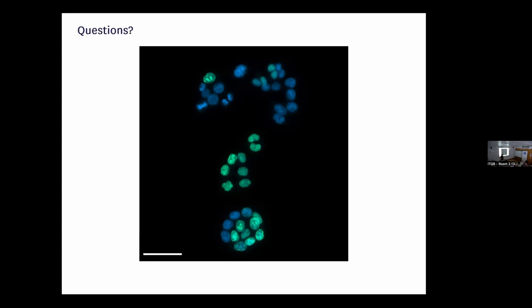Typically, when you're talking about damaging, those are usually much higher laser intensities than the ones required for photobleaching. I mean, sometimes we bleach with 100% laser transmission, but sometimes we don't need that much. It really depends. But I don't see why it would be a problem. You'd be combining both, and you would photobleach and see the recovery. Or you could combine different wavelengths, one for damaging, the other one for photobleaching, in a different wavelength, and you could still get the dynamics.